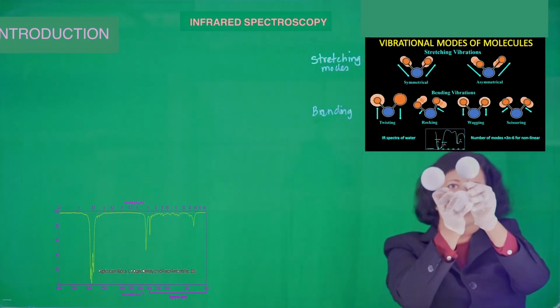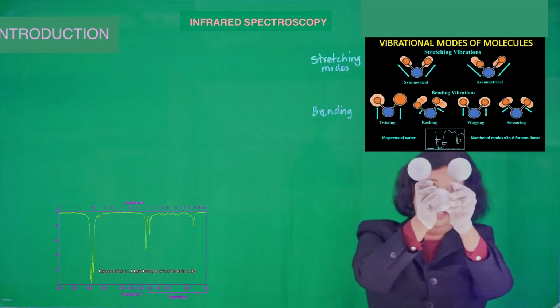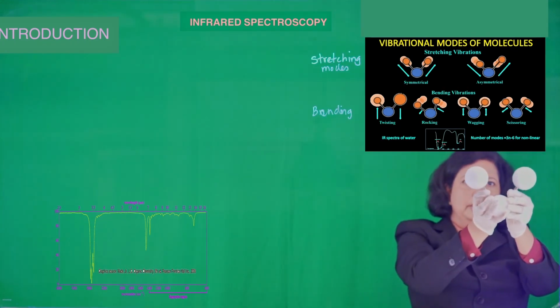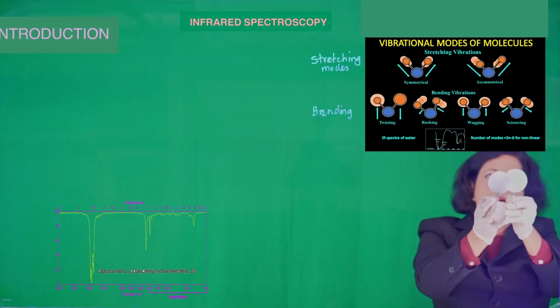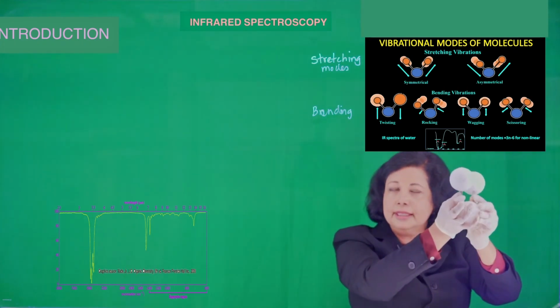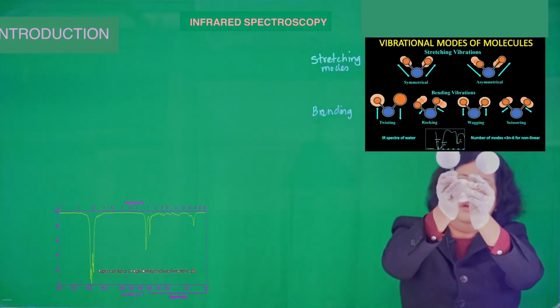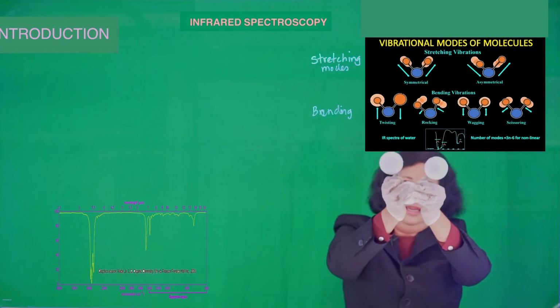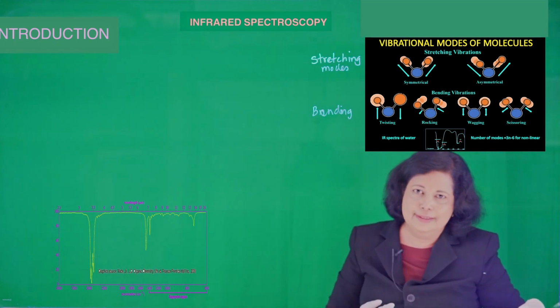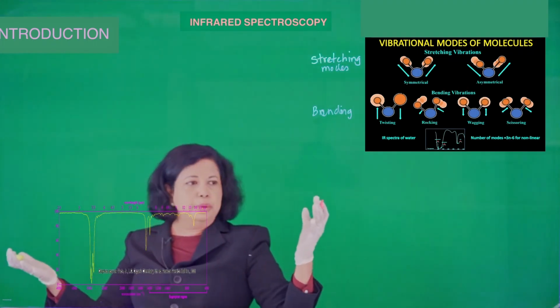Like in a stadium. All right? Everybody hold their cell phone up and then they start rocking. That's rocking for you. So there you go. And then twisting is when you twist. So basically molecules are just happy to be alive and they're dancing when they get hot in the infrared region. They're pretty hot here. Okay, and here's rocking. And here's wagging. And here's scissoring. Basically they're just dancing away. All right. Great. So let's look at some for the CH2 where they would absorb.